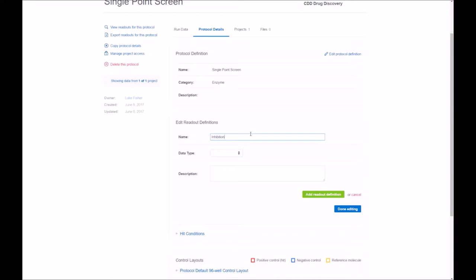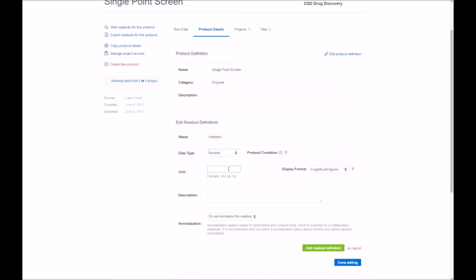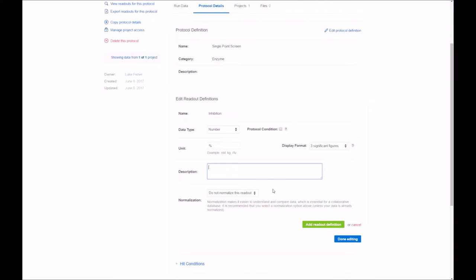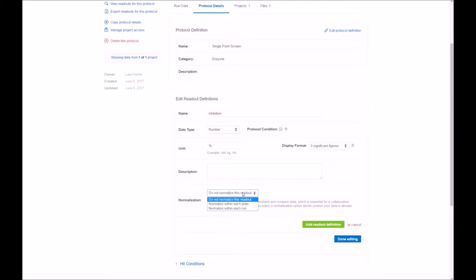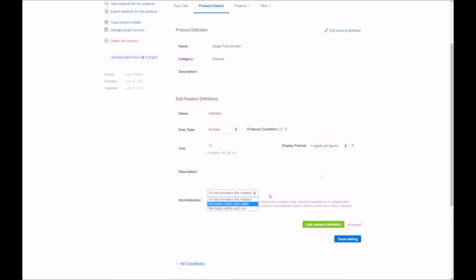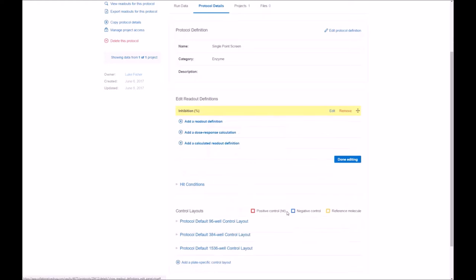So first, we start with reading in inhibition. It's a number type. You can see the different choices there with a unit of percent and provide a description if you'd like. We won't normalize the data in this case, but you have that option available to normalize based on your research needs. Add the Readout Definition green button. We'll make sure that it adds it to the list.